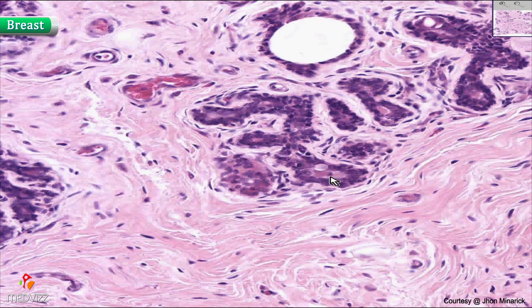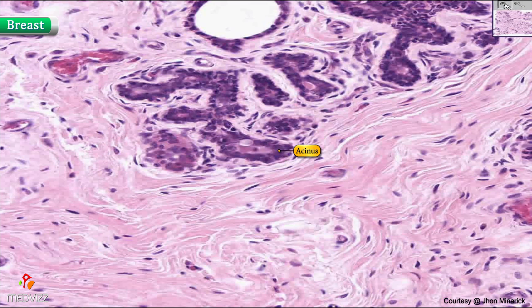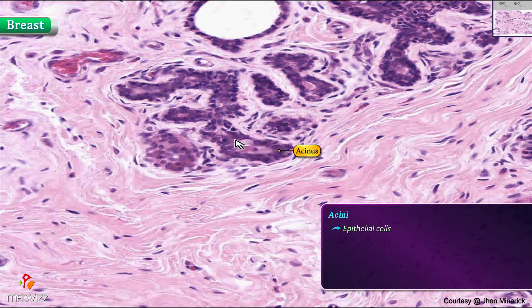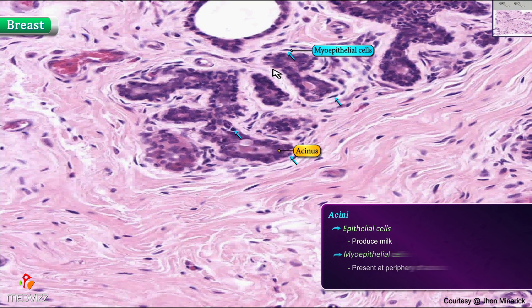The acini have basically two kinds of cells. There are the actual epithelial cells, which are making the milk product. And then there will be little spindly cells, possibly here and here, right at the periphery of the acinar groups. These are the myoepithelial cells.